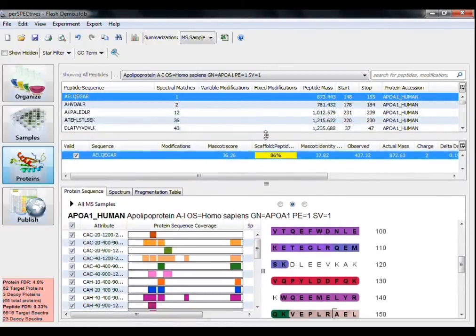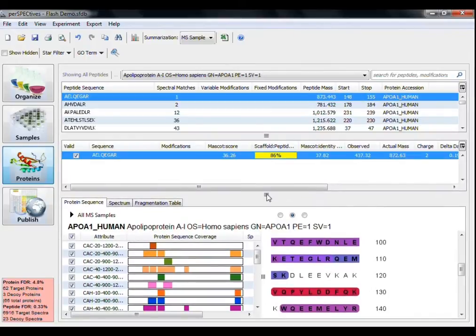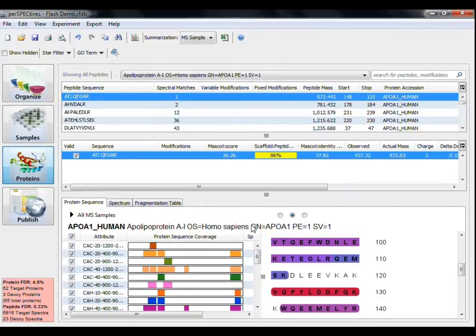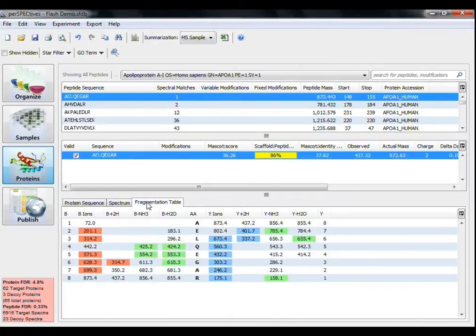Which displays each identified peptide for a selected protein, the Validation pane, which displays each valid spectra identified for a selected peptide, and the Visualization pane, which provides information tabs about the amino acid sequence of the selected protein, the MS-MS spectrum graph, and the peptide spectrum fragmentation table.